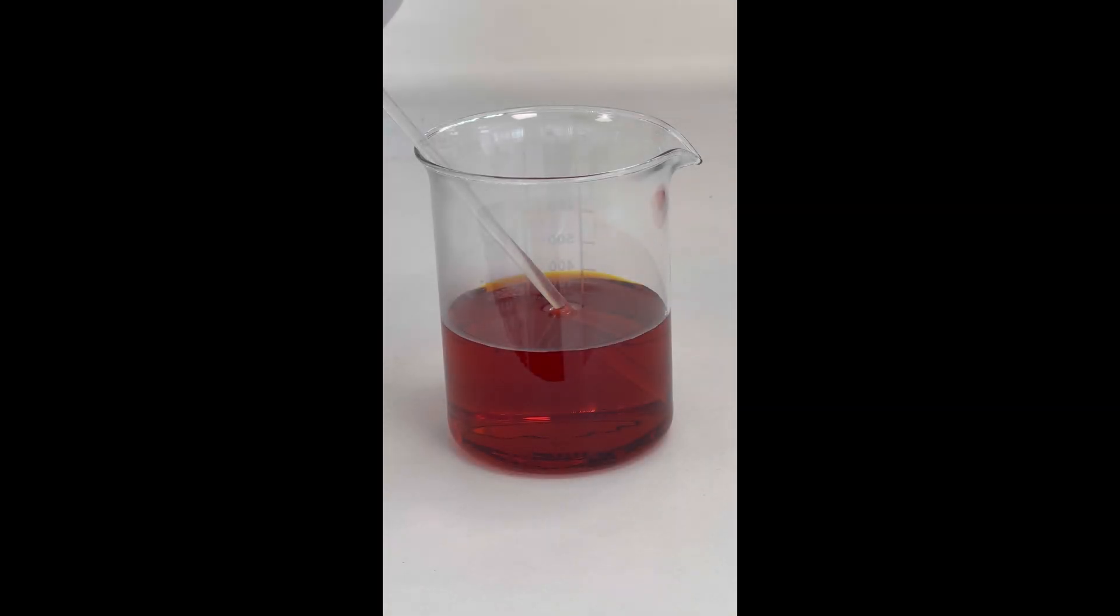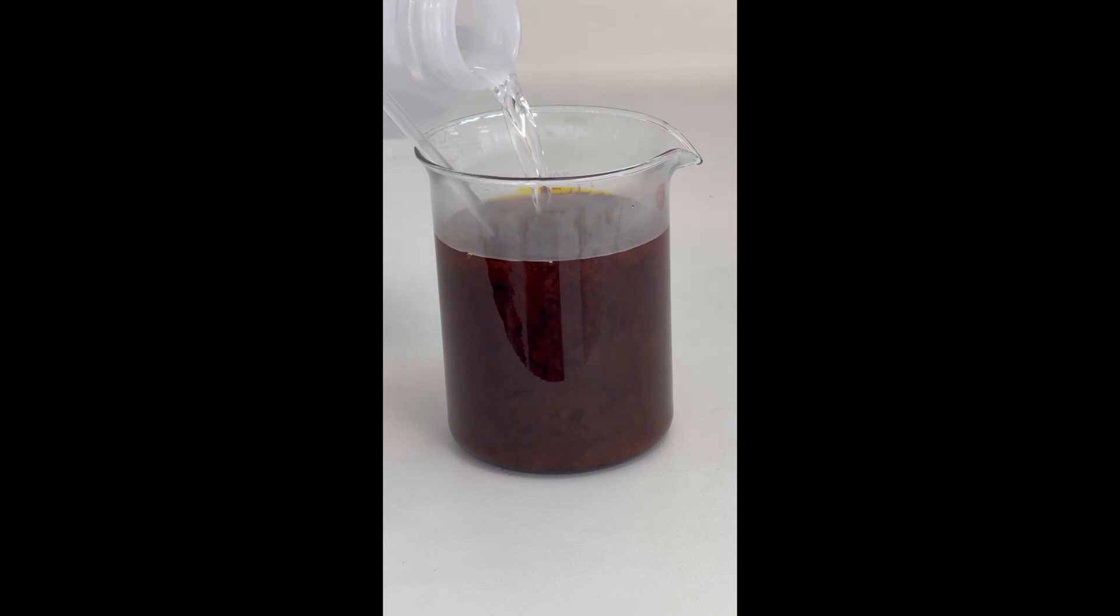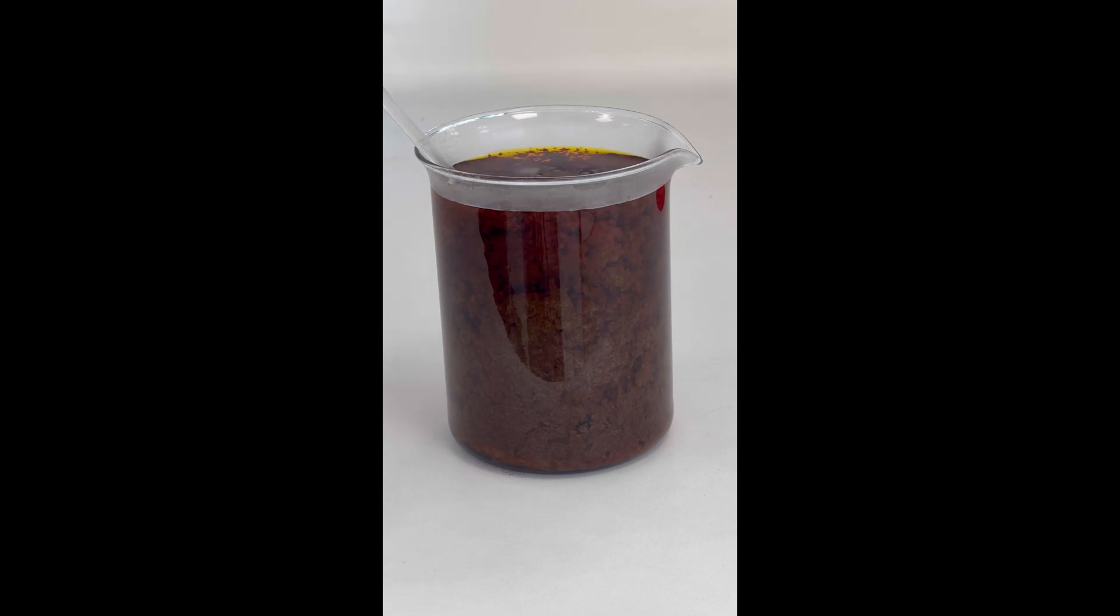In a separate beaker, we dissolve 50 grams of iron chloride hexahydrate in water. To this solution, we add potassium hydroxide until all the iron precipitates as iron-3-hydroxide.